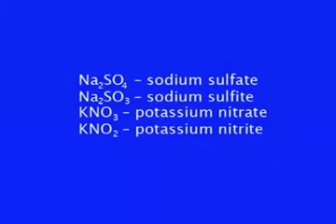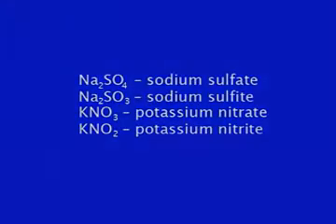In handling solid chemicals, the first step is to carefully read the label. Many chemicals have names and formulas that are very similar. For example, Na2SO4 is sodium sulfate, Na2SO3 is sodium sulfite, KNO3 is potassium nitrate, and KNO2 is potassium nitrite. Despite the similar formulas and names, these chemicals have quite different properties. Erroneous data and potential safety problems could result from using the wrong chemical.